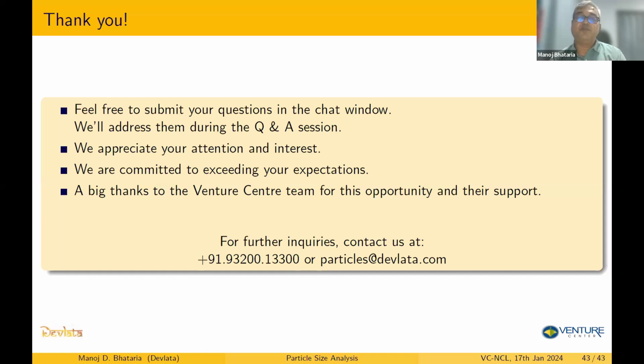If you're looking at small particles in suspension, then backscatter is what we would prefer. But if the particles are scattering a reasonable amount of light, then I would stick with 90 degrees. But at 90 degrees, you have to make sure that the sample is fairly dilute. If the concentration is high, there may be too much internal scattering, and that may lead to wrong results.